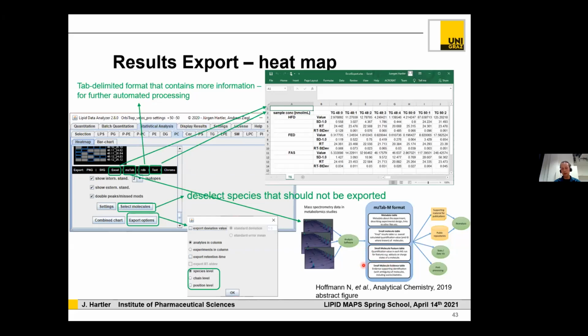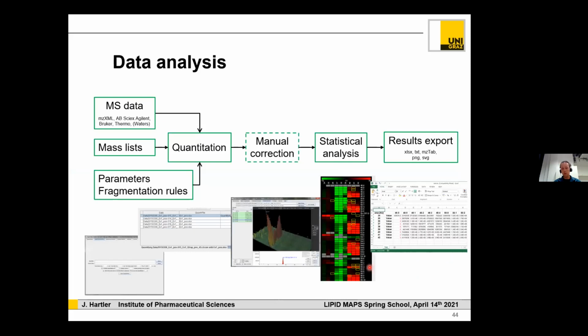And the last small molecule evidence table contains the spectra and the ions. So then I am finished with my introduction.